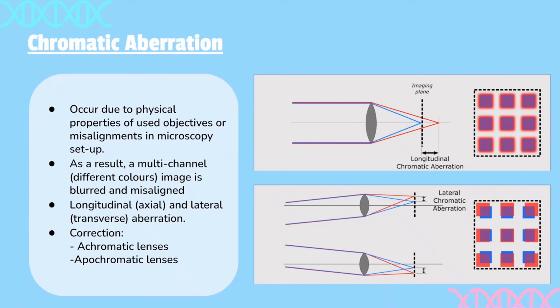As such, another lens called apochromatic lenses is used. When producing the lens, fluorospar is added into the glass formulation. As a result, three colors, red, blue, and green, are placed into a single focal point, causing the chromatic aberrations to be insignificant.